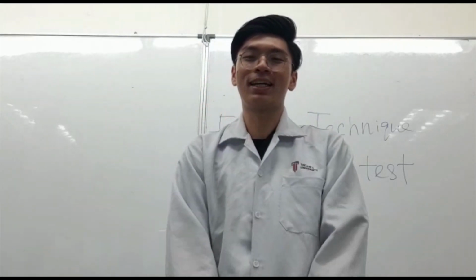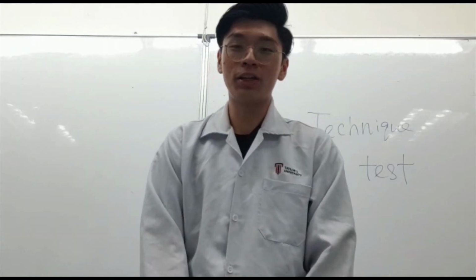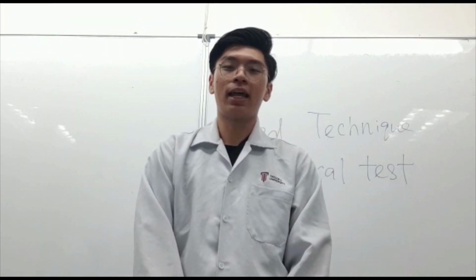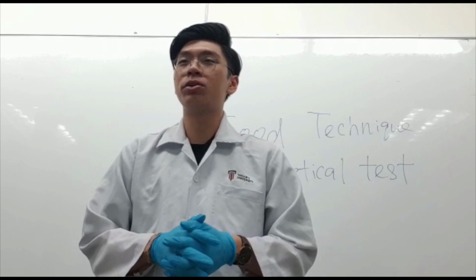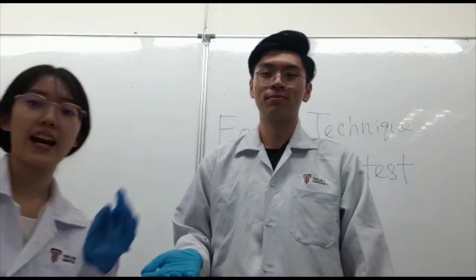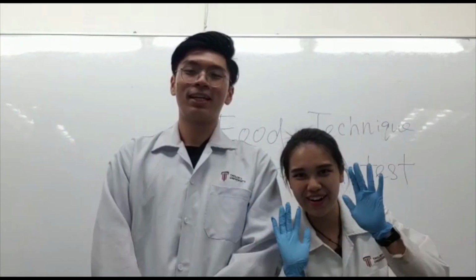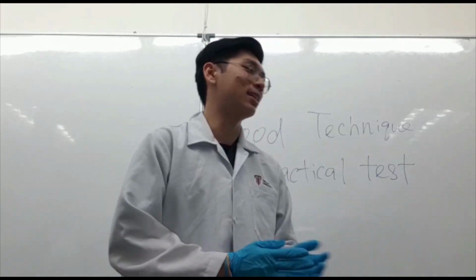So today, our group are going to do the Technique in Food and Nutrient Evaluations practical test, and we are from Group 3. Let me introduce my members. First, I'm Malvino, and next here is Celine. Hi, Dr. Neo. And next is Corine. Hi, Dr. Neo. And last but not least, we have Khai.